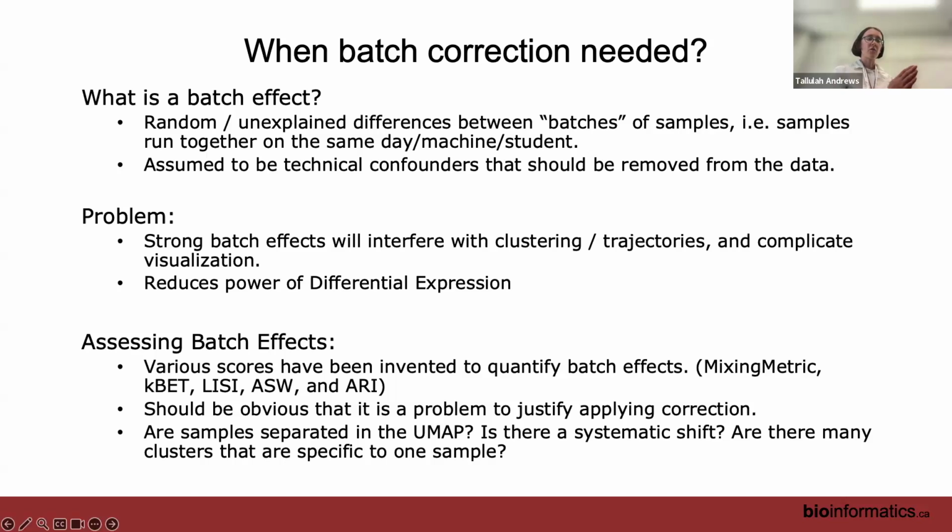We might also look at whether this is a systematic shift in all of the clusters, or is it specific to certain clusters where we have what looks like a batch effect. That could also influence our decision to do data integration or not. And you might be asking, why do we even need to check? Why don't we just always do batch effect correction, right? If we have different batches, just always do batch effect correction.